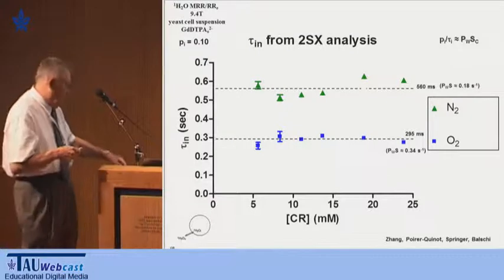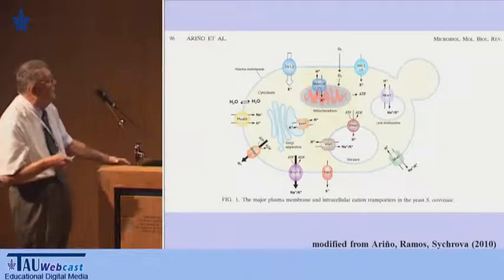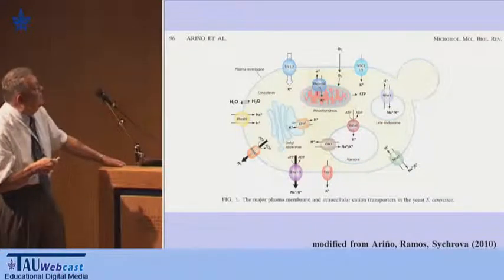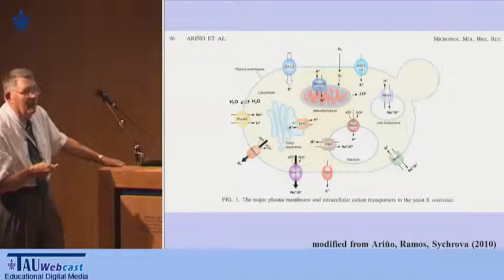Well, what could be causing that? Well, most of you know a lot more about metabolism than I do. One of the main things that oxygen is doing, as we've heard from many people, is coming into the cell and being used to make ATP at the mitochondria. So perhaps, why on earth should the water equilibrium exchange care about what is the level of ATP in the cell?